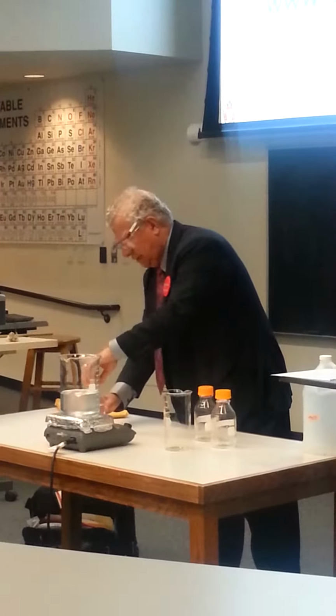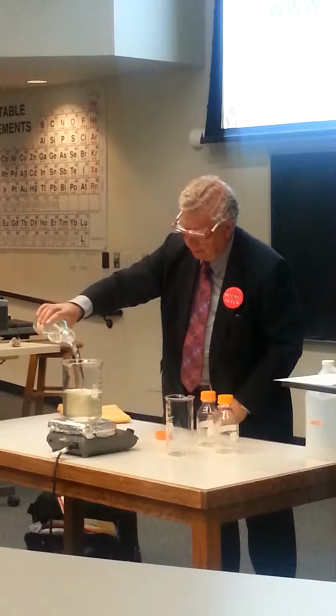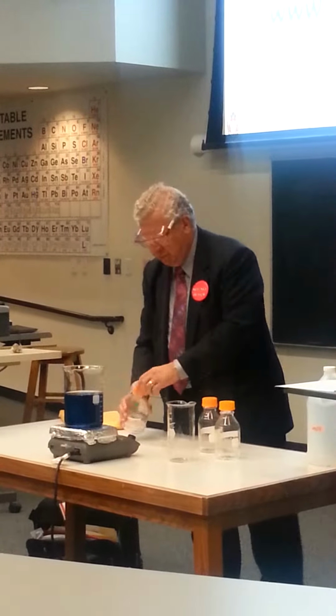Now I take the third liquid, and I add this one. And I get this beautiful color change where I end up with this beautiful blue color.